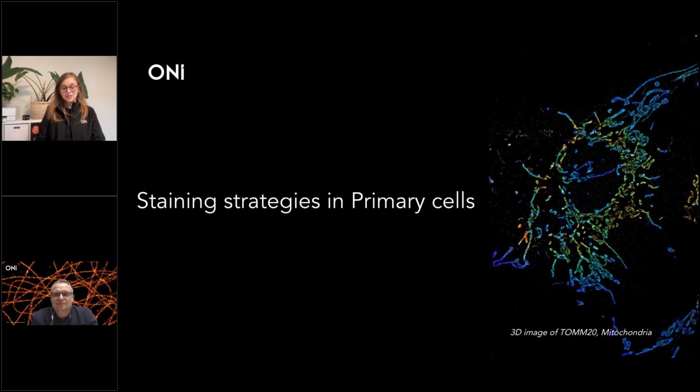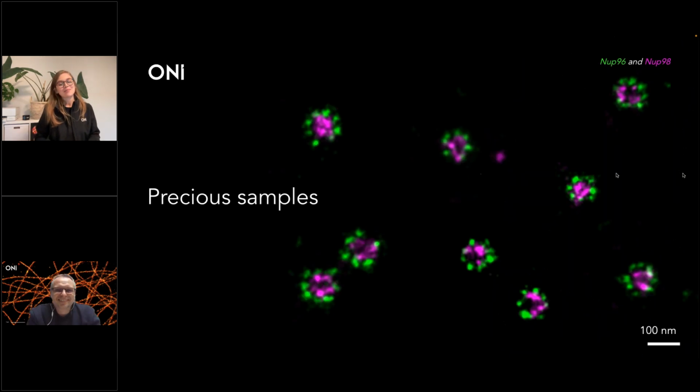Okay, talking about tissue and very exciting applications, I want to dive a little bit deeper into our last section of today, which we call precious samples. All samples are, of course, precious, and we want to make the best protocols to visualize in the best manner. But actually, how would I go ahead and image cells in suspension? Can I image in suspension, or what do I need to do for dSTORM?